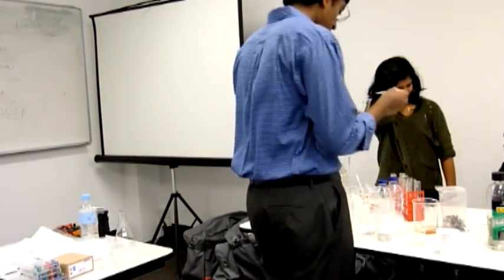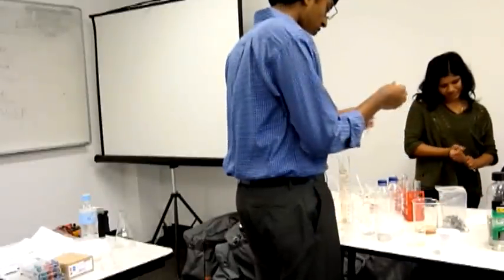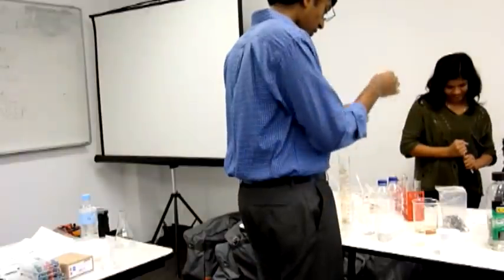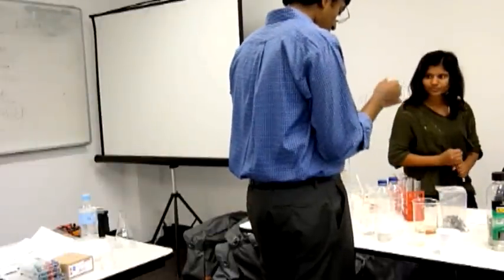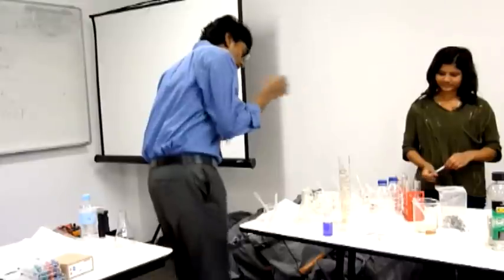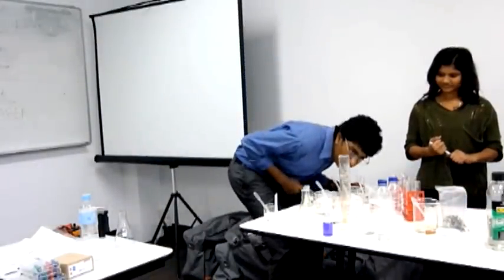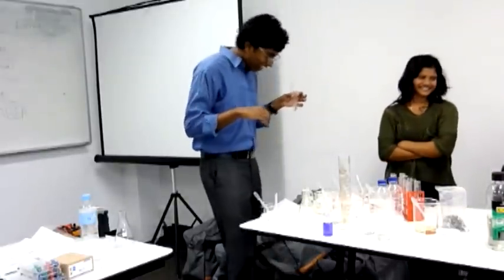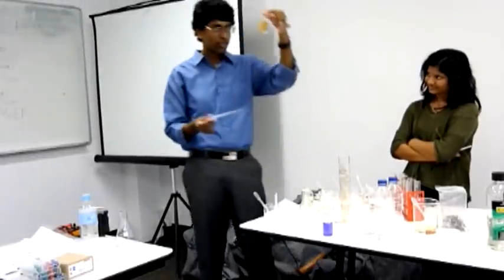Sodium hydroxide. What are we testing for? What could possibly happen? There is steam. A blue precipitate could form, a green, or a brown. If it's blue, what would it be? Copper. If it's green? Iron 2 plus. And if it's brown? Iron 3 plus. Good. So let's check it out. Steam's coming out of this. What are we adding? And I go H. Orange. Red? No.